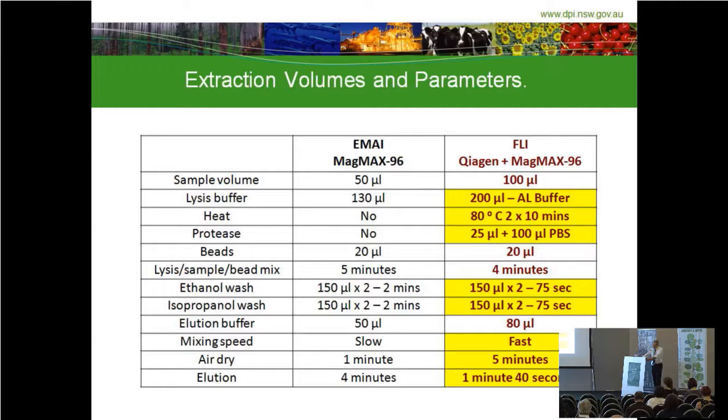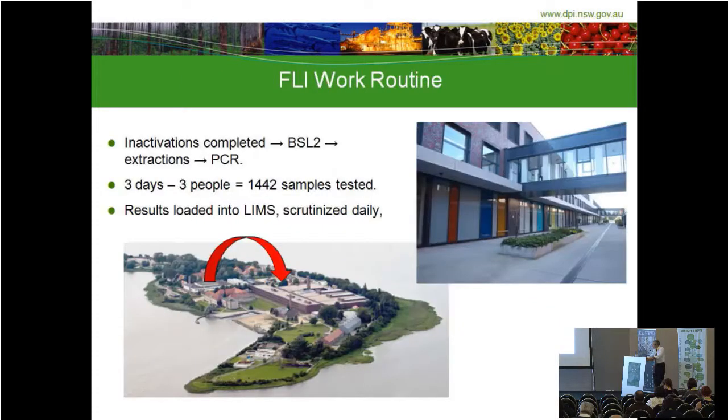And I was concerned that using larger volumes in some cases does not improve the quality of your real-time PCR. So if we're testing semen in our lab, we do semen undiluted, but we only use 25 microlitres of sample, because if we do that, we can get around inhibitors and we get a better result than if we use 50 microlitres. So there were many differences in the protocol, despite our overall goal of trying to keep it simple and follow the standard protocol.